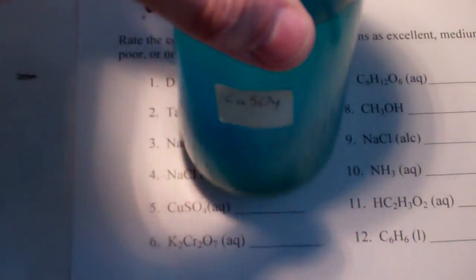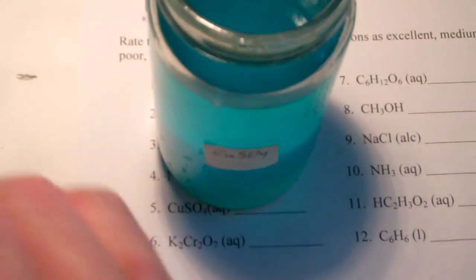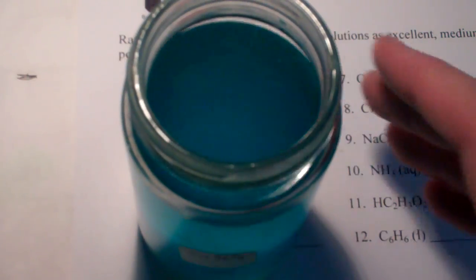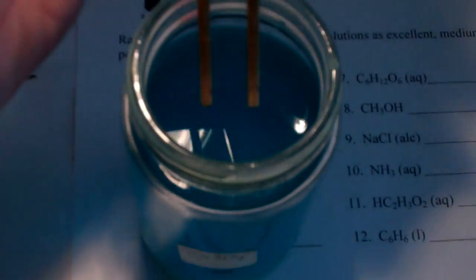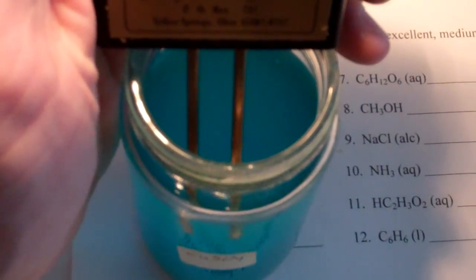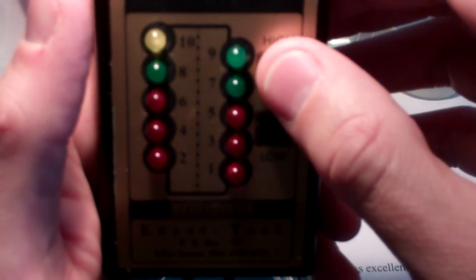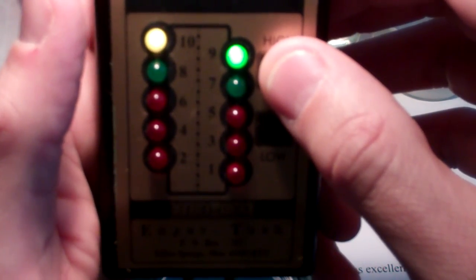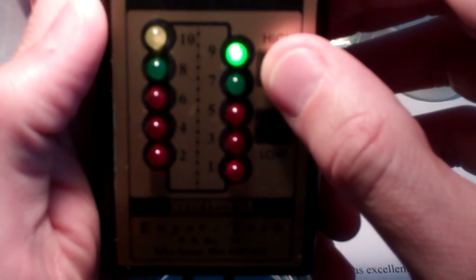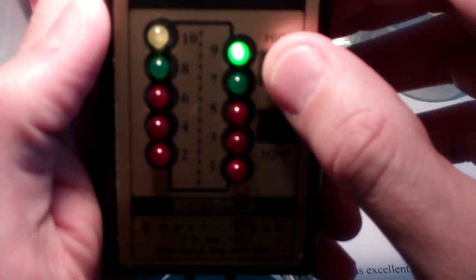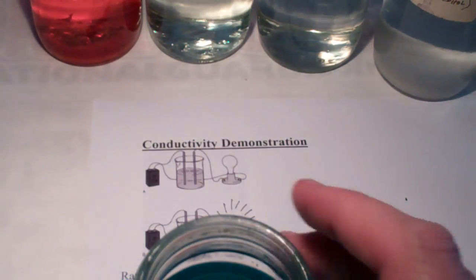Next up, is copper sulfate dissolved in water. So, what do you suspect will happen here? That's an ionic compound dissolved in water. Will you expect high conductivity, low conductivity, or none at all? Well, let's try. We'll press the low button. It says 10+. Press the high button. And that is all the way up to, looks like, 90. And for a moment there, if you guys saw, the 10 went up. So, so far, that's the highest of all at 90 units.